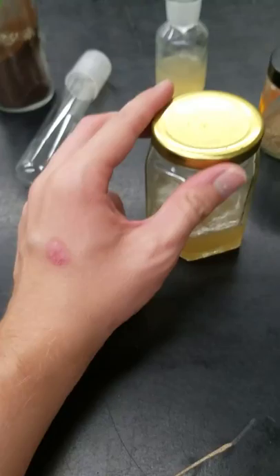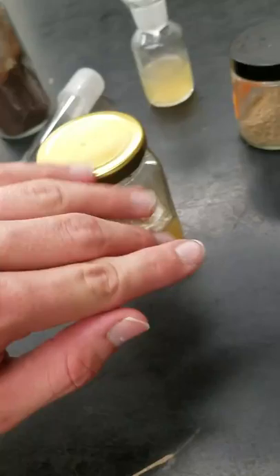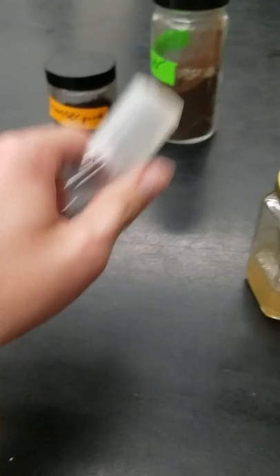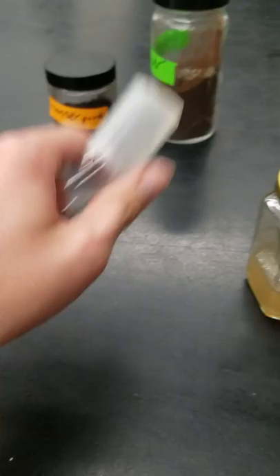Phytotechnology Lab will also sell vessels for tissue culture and a few other things. You can find tissue culture vessels for less money than at Phytotechnology Lab — you can go on Amazon or Walmart and get mason jars or these hexagon jars. I like these better than mason jars because the lid just twists on and off. The only thing is before you open this, you have to wipe alcohol over it because the shelf will keep dust and contaminants that when you open this, it'll vacuum them in and cause mold to grow. There are also these test tubes that are specifically meant for tissue culturing. What I normally do is jam some cotton in here before I pressure cook.